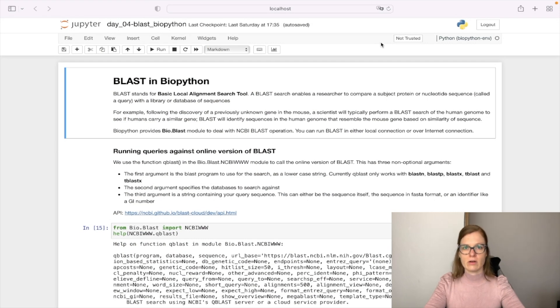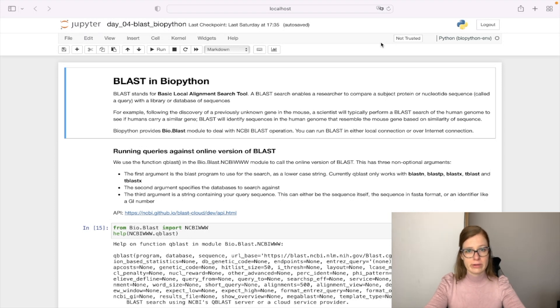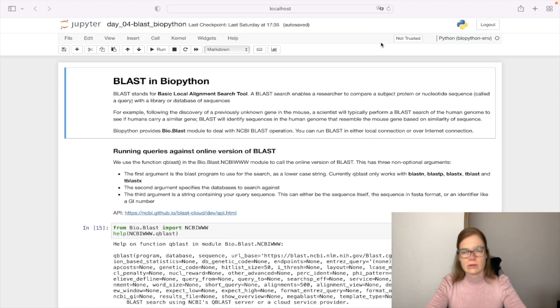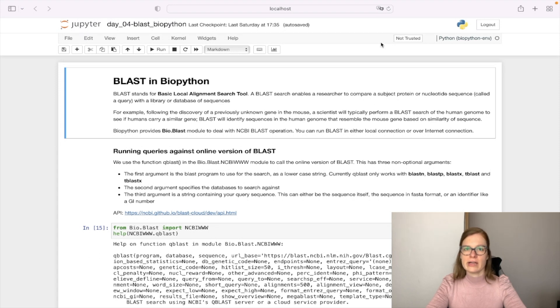BLAST stands for Basic Local Alignment Search Tool and enables us to compare our protein or nucleotide sequence with a library of sequences. We can use this to find similar sequences. For example, if we discover an unknown gene in mouse, we can use BLAST to search against the human genome to see if humans carry similar genes.